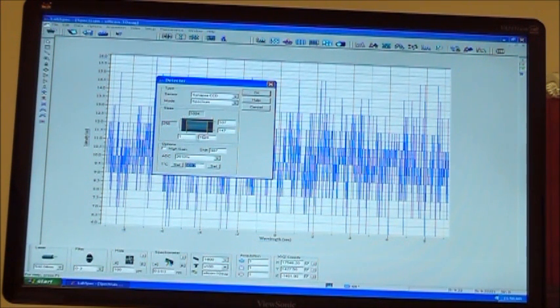They're using from the first pixel to the 1024th pixel, and in here we're using from 107 to 147, because that is where the data falls across your chip. So we shut off the first 100 pixels and the last 100 pixels to help the signal to noise ratio, and we only use the 50 pixels in the middle.